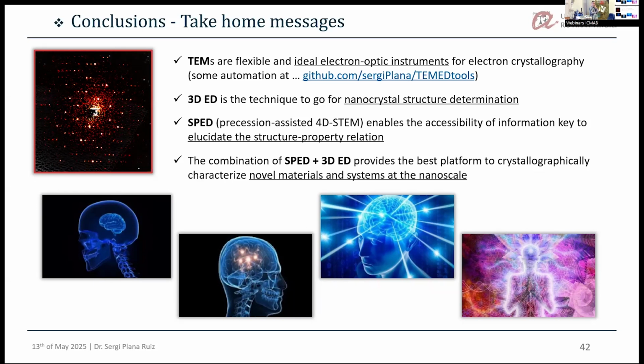Well, the energy of the electrons that go through the sample, you mean? Yes. Well, this depends on the voltage. I mean, you apply. For example, with our microscope, you can apply from 80 kV to 200 kV. Energy in joules, I'm not so sure, but kilo electron volts, yes.